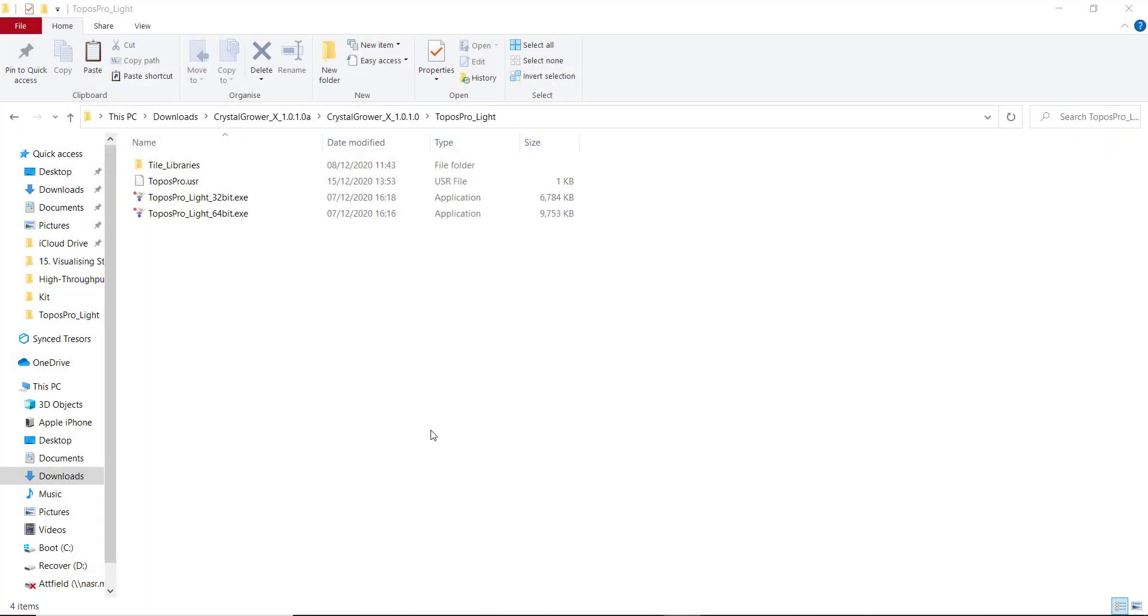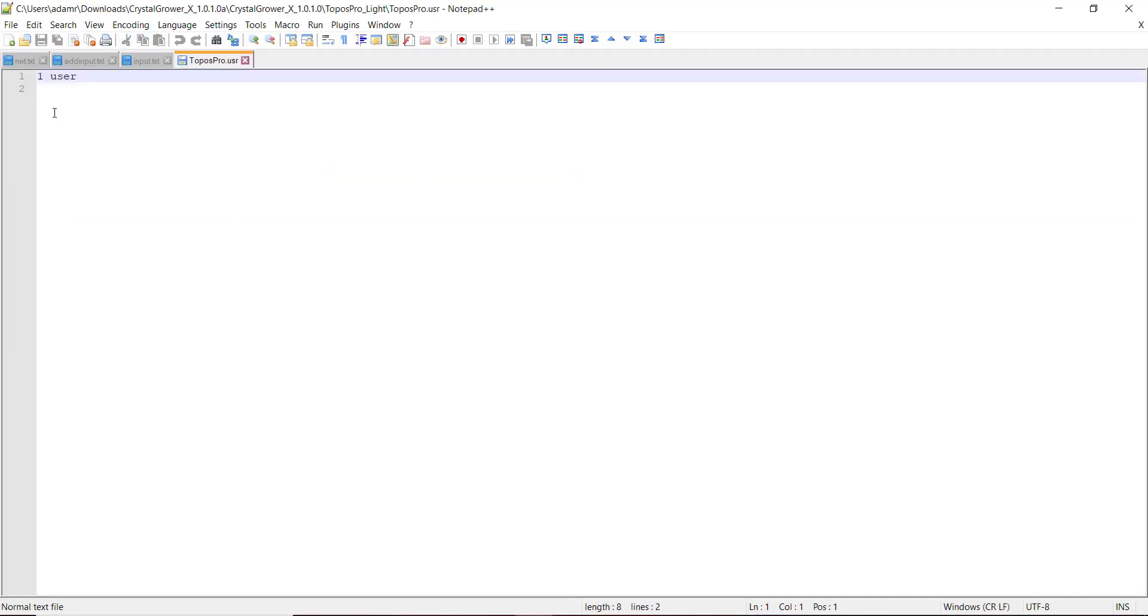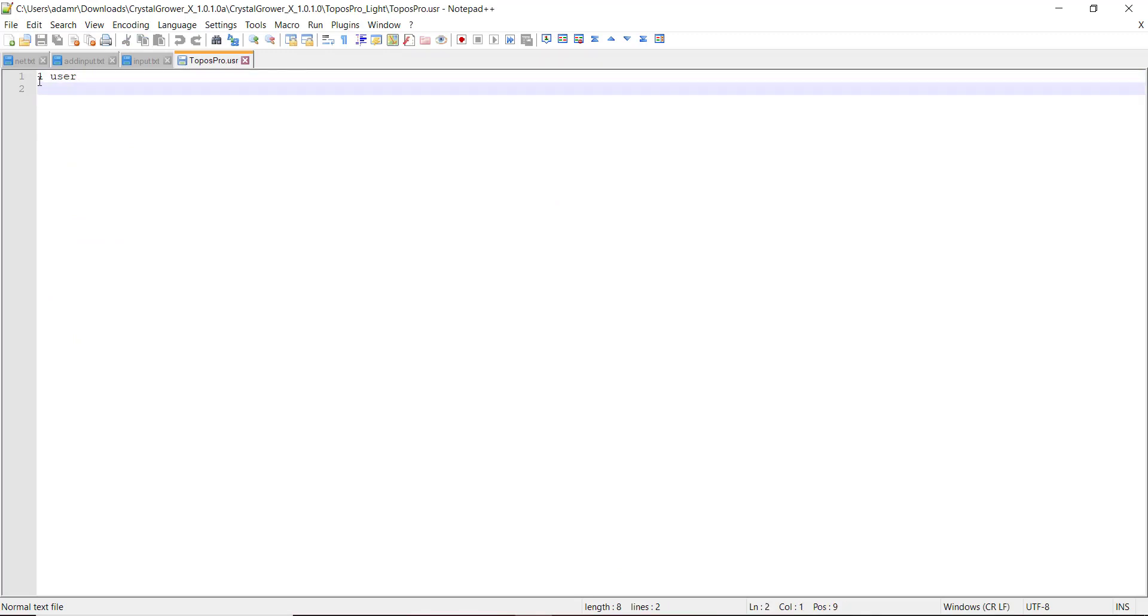There is one other file in the directory that I'll draw attention to, which is the ToposPro.usr file. If I just open that in a text editor, you can see it just contains one line of text, which is one user, and one will be your user code.